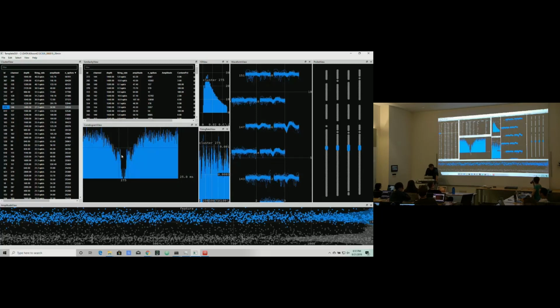Okay, these guidelines here are also new. By the way, this is Phy 2, so Cyril is currently in progress with this. So if we find bugs and stuff, it's because of that, but already I see it's a lot more stable than the last time I used it, so that's good.